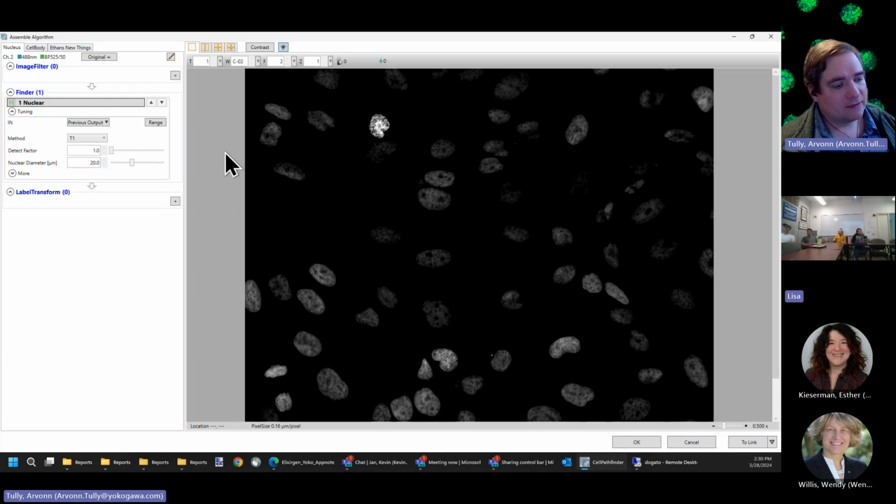It takes that entire well, scans the entire plate or the entire well, and moves that data over to CellPathfinder. CellPathfinder analyzes it, finds hits, so it'll find all the spheroids, and then it'll pass back a list of XY positions to the CVACE software, and the CVACE will then tell the CQ1 software to run a second pass. So it might do a high resolution scan of each spheroid.